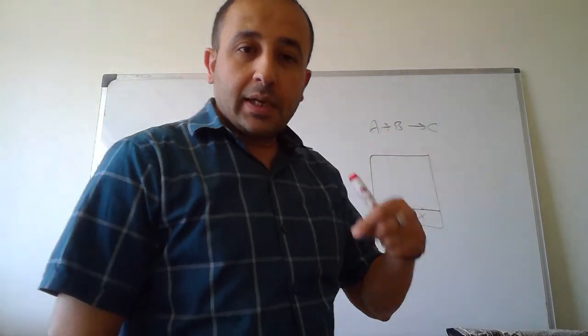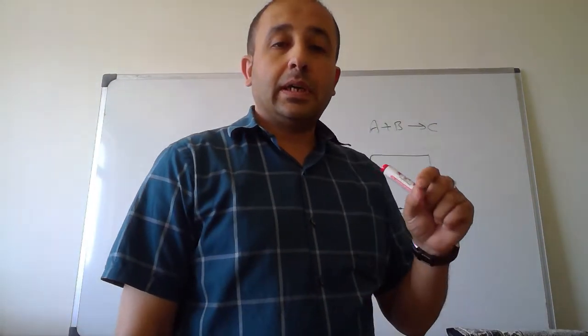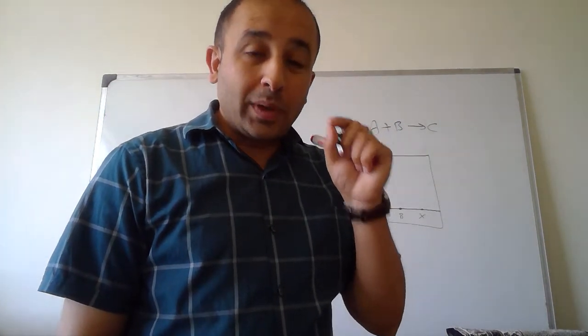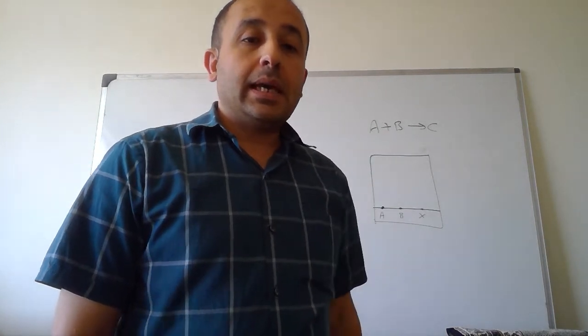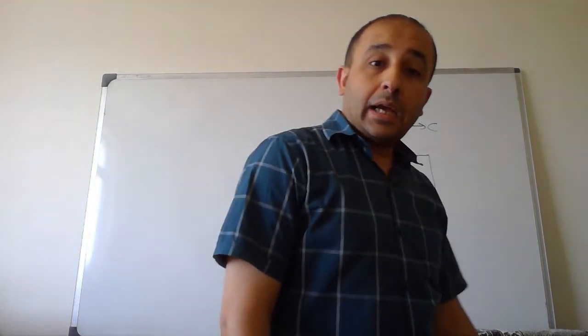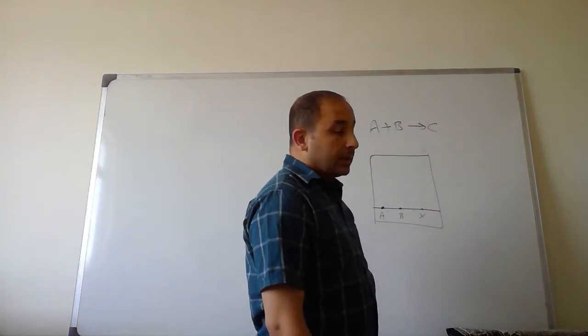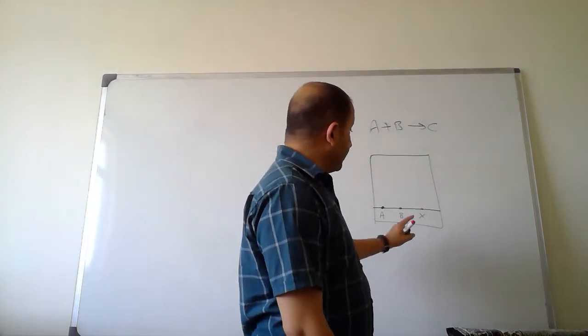But this is a reaction vessel, and we take a sample from the reaction vessel, and we have to emphasize that the quantity of the sample should be the least possible quantity, and in this case we just spot this quantity from the reaction vessel.